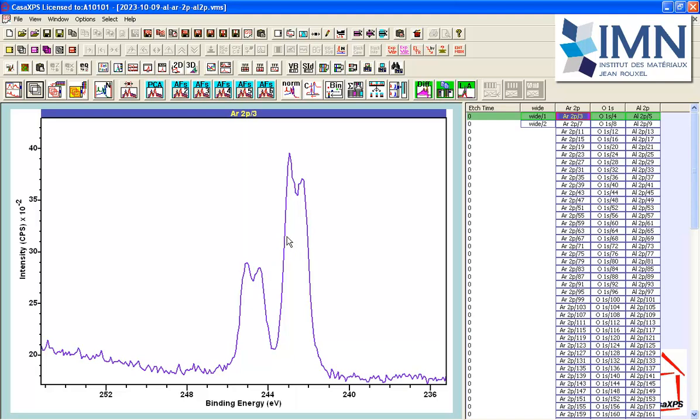And this is important for peak fitting because we can use this to construct constraints that help guide the peak model to a more reasonable solution than if we don't use any constraints at all. I will now construct a peak model based on observation of what I can see in the data based on one spectrum.